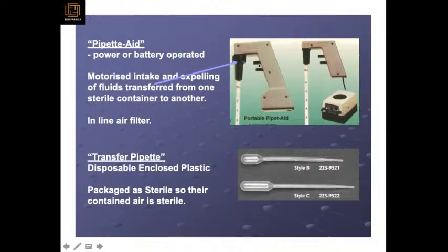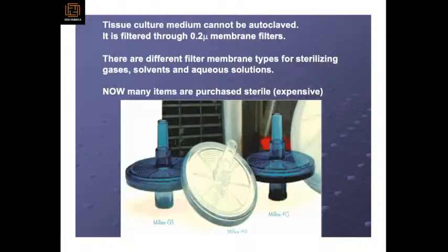Pipette aid: you must take care that when you're using your pipette aid, the pipette boy, the medium should not go inside it, otherwise your media will be fully contaminated. In earlier days we used to suck all the medium up, which is not good, and makes your pipette boy stop working. This is for sucking, this is for putting them out. So that's how you use it. And these are the microfilters, 0.2 micron membrane filters, through which you sterilize your media, so that small microorganisms do not get through.